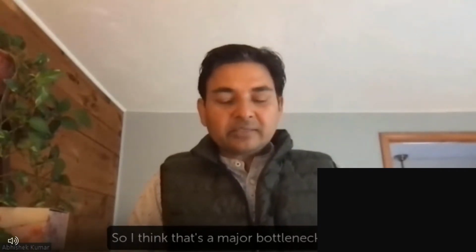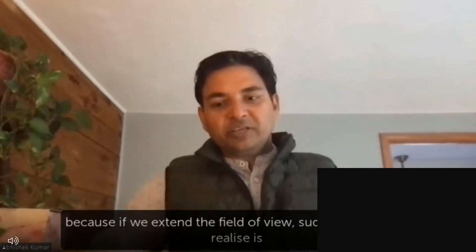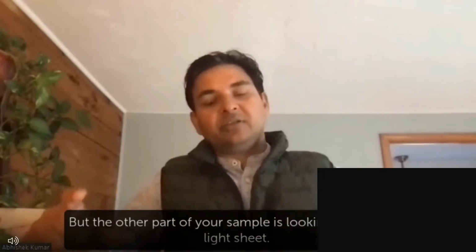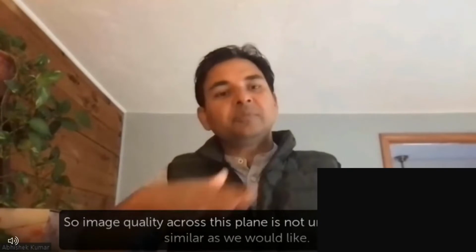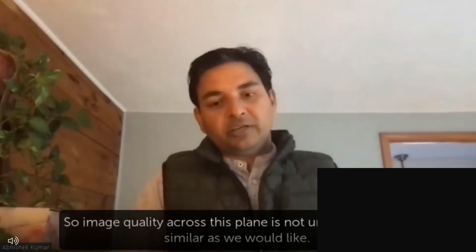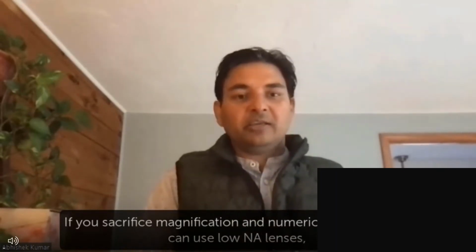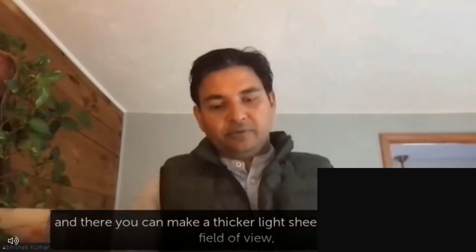So I think that's a major bottleneck for us, because if we extend the field of view, suddenly what you realize is part of your sample is seeing a thin light sheet, but another part of your sample is looking at a very thick light sheet. So image quality across this plane is not as uniform or similar as we would like. So that's one of the challenges. If you sacrifice magnification and numerical aperture, you can use low NA lenses, and there you can make a thicker light sheet and extend your field of view.